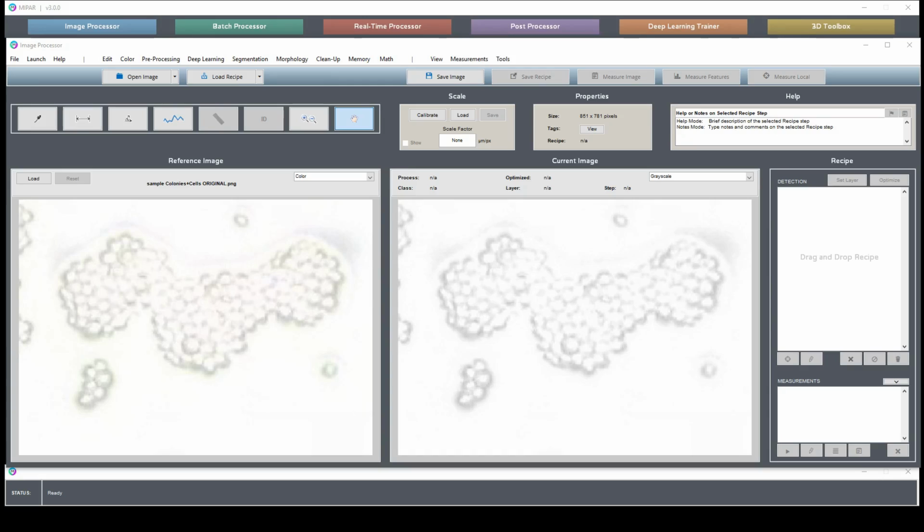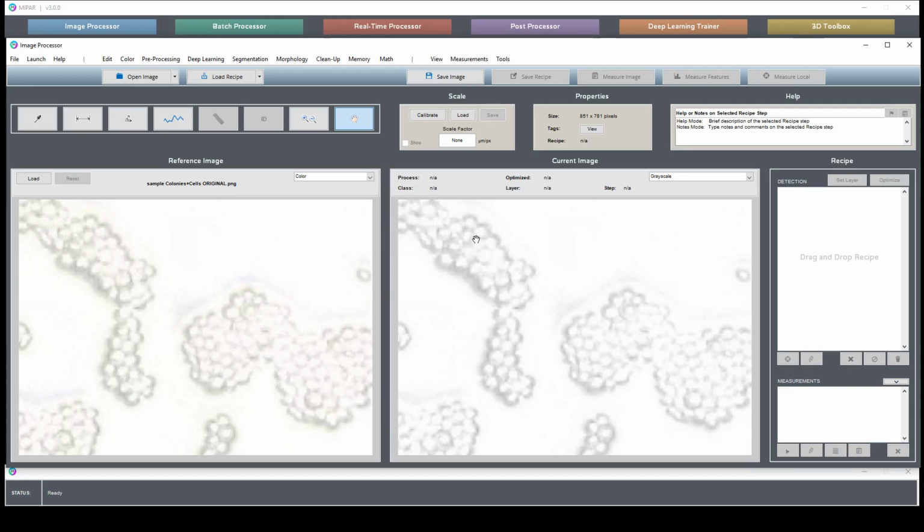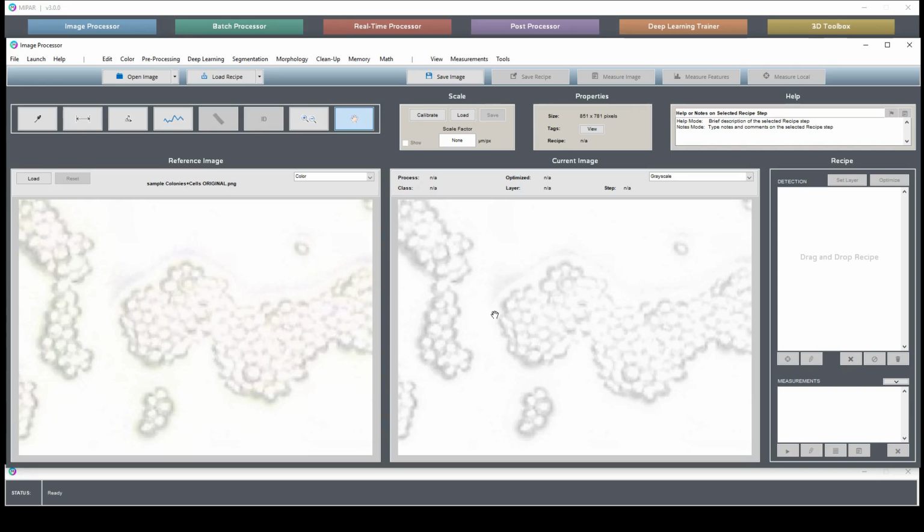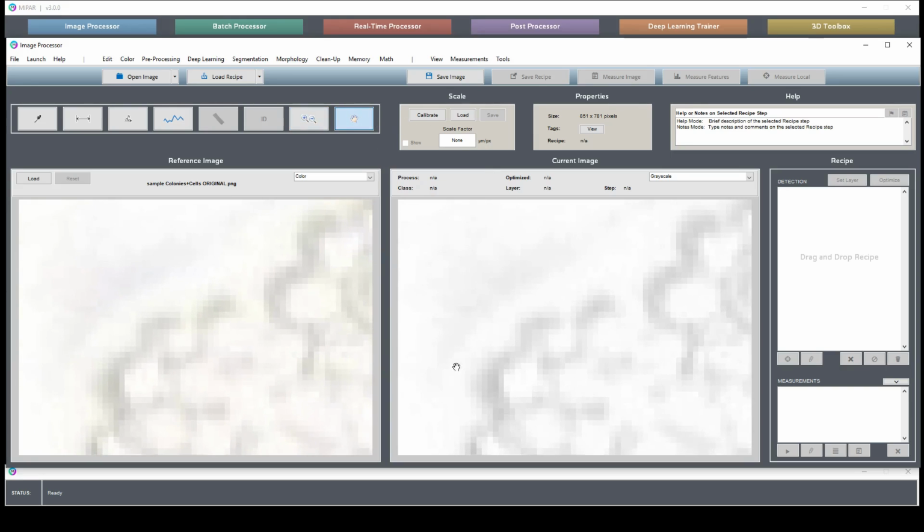So to compensate for the fact that dark texture is going to pick up some of these halos, in a second step, we'll use the bright texture function. The bright texture is going to pick up the individual cell bodies, but it might also pick up some of the space between the halos, because this would also be found as a bright piece of texture.